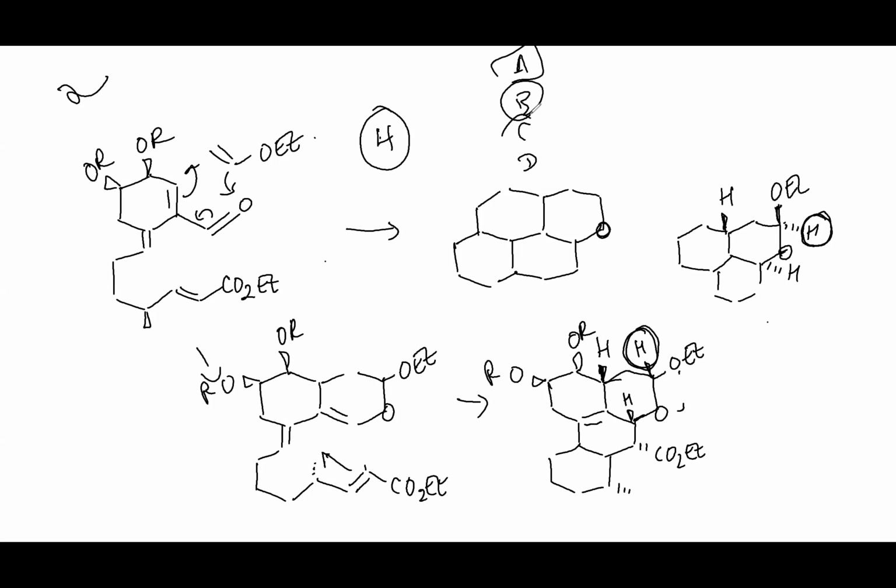But anyway, this proton here, in some diastereomers, was a triplet, and in other diastereomers, it was a doublet of doublets, based upon how it was interacting with these 2 protons next door, because it has 2 neighbors.